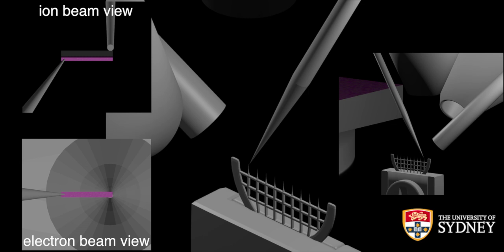The last little bit is a little bit finicky, so try to be careful when you're aligning the whole assembly and moving the stage up. The last 1 or 2 microns on the mechanical FEI stages, I like to do by hand, just because you can, and it gives you pretty good control. On the Helios systems, because they have a very, very good stage, I tend to just literally ram the support structure into the lift out bar. It will stop immediately and it will be perfectly aligned. So that works very well.